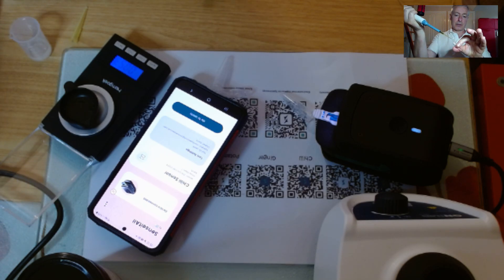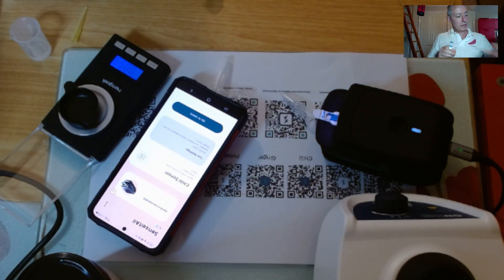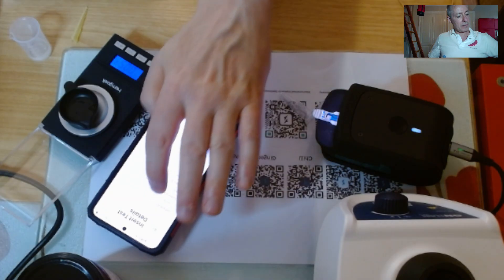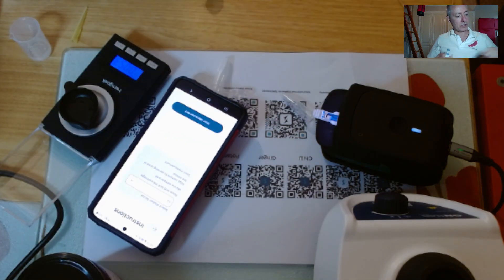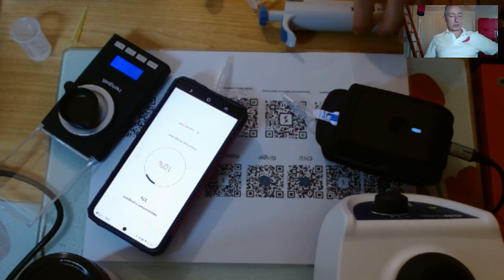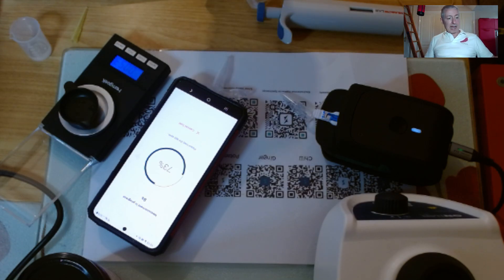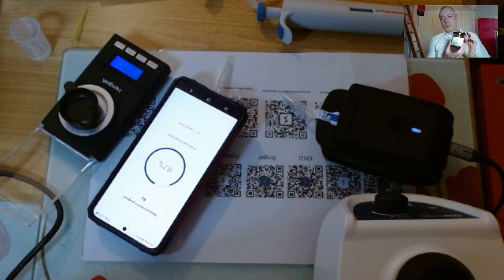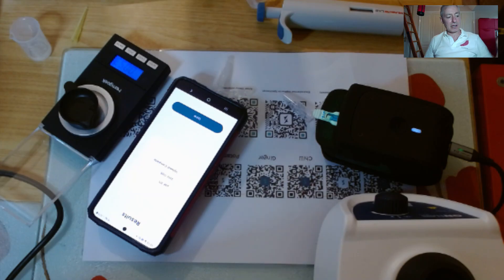So this is the sample I just prepared – 50 microliters has gone on. I'll give it a name so I can find it later on, and I'll go to assay, start measurement, and off we go. So now it's going through the actual assay itself. Because it's a jelly or jam, it's quite liquidy, so it's quite easy to extract it and get the capsaicin out of it. I have tasted this – I had some on some toast. It's not super hot; it's nowhere near a mild sauce.